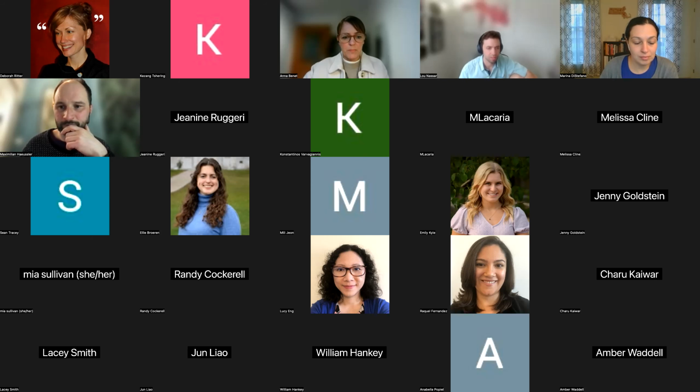So you showed that list of the tracks underneath the browser, and all of the different tabs that you can go through. But are there any, from your perspective or insight, that might be more beneficial in terms of curation, or does anyone else on the call use specific tracks that they might want to highlight as well?